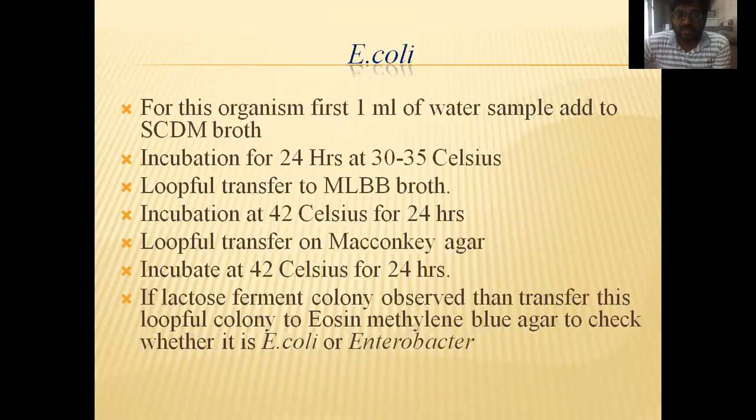If a lactose fermenting colony is growing, then on the second day you have to transfer the loop onto the MacConkey agar to check lactose fermentation or non-lactose fermentation. Again, you have to incubate for 24 hours on the third day. On the fourth day, if a lactose fermenting colony is observed, then you have to transfer this loopful of colony to the eosin methylene blue agar to check whether it is E. coli or Enterobacter. If a metallic green shine is shown, that confirms that your water is containing Escherichia coli.